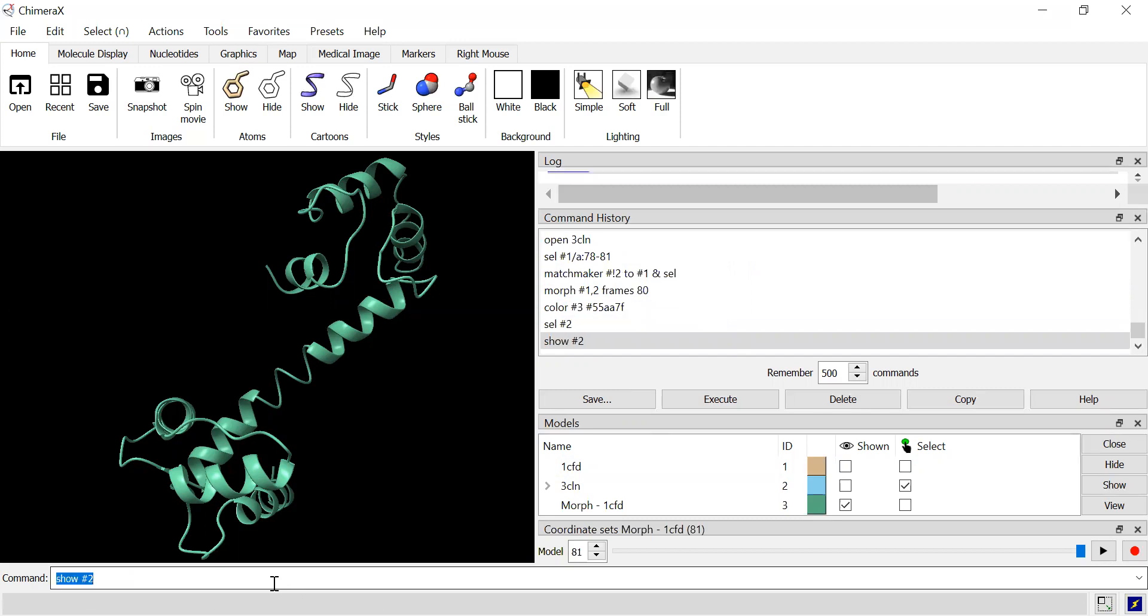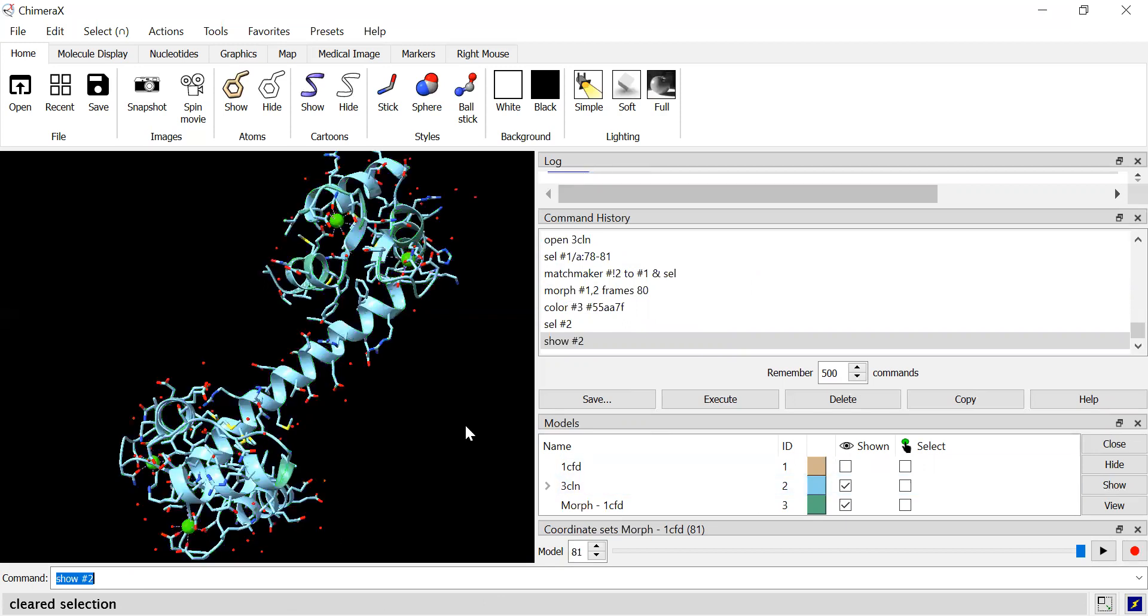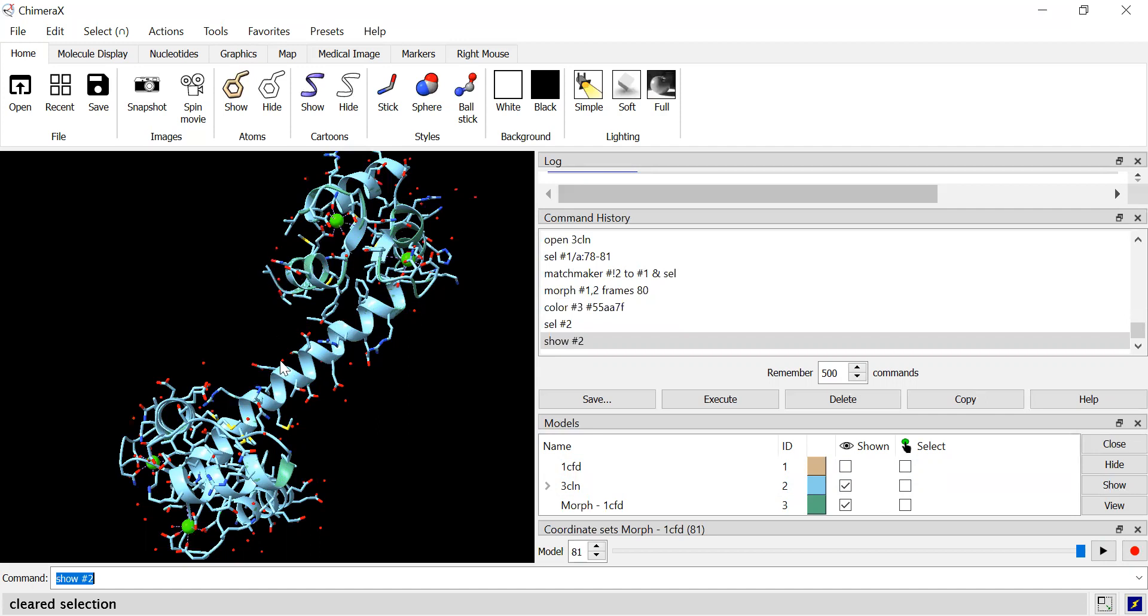So I'll pull this up here. So, yeah, now we've created a mess. So we've got, as you can see, all this blue is figure two right here. Now, if you want to get rid of the whole protein, which you can do without showing it all as I have here.